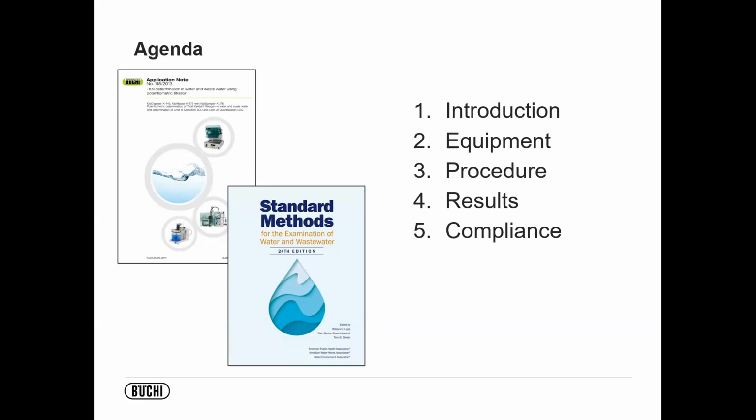Really we're going to be following an application note that we developed, going step by step within the experimental process. Then the results that we've seen from this particular test run, and how it relates to the compliances that you're following. You can see the standard methods booklet there on the left, and everything you're going to see today is completely compliant with 40 CFR part 136.3. So that's really going to be a driving force with today's presentation. Then some conclusions as to everything we discussed, and how automated Kjeldahl may compare to some other things and how effective it is, the resources that are available, and lastly, like I mentioned, a Q&A session.